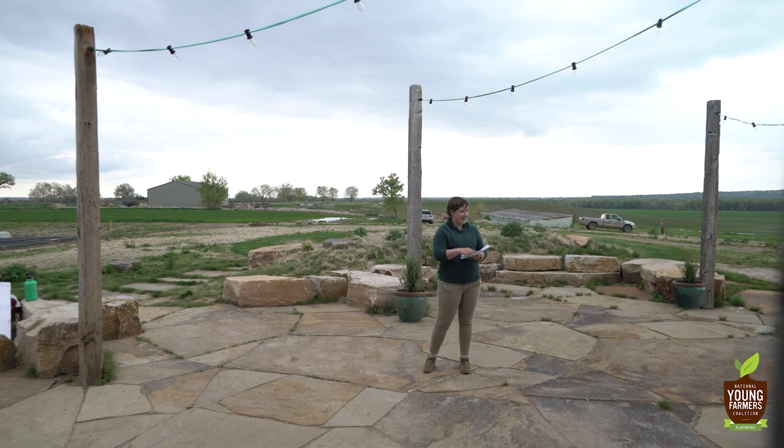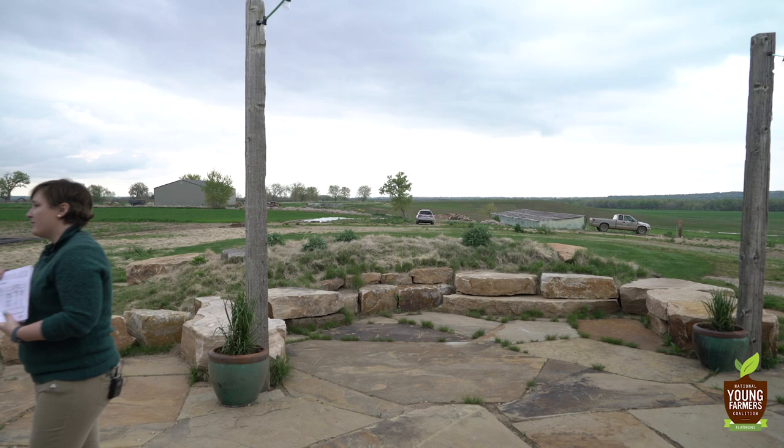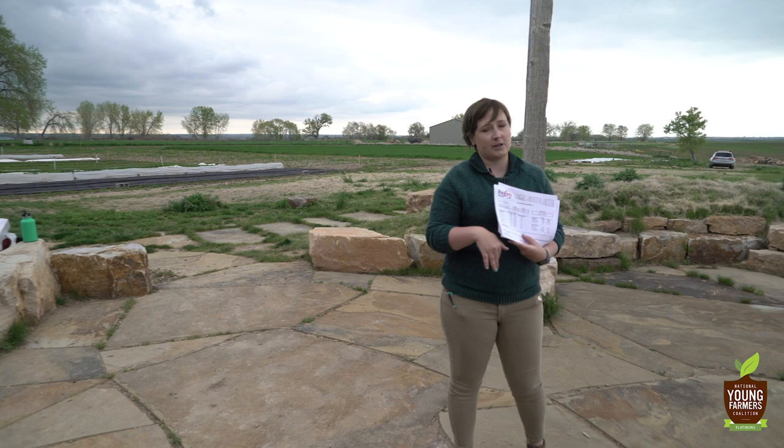So we do like the Haney test. We have a few examples in here. There is one. I think the worst one was number 3. And even then, a lot of times the people who are getting these tests have already been doing good soil management practices for soil health, so a lot of them are coming out looking pretty good. We see those numbers dip, and we see our mycorrhizal population dip. Does everyone know what mycorrhizal is? I'll talk about it. Okay.